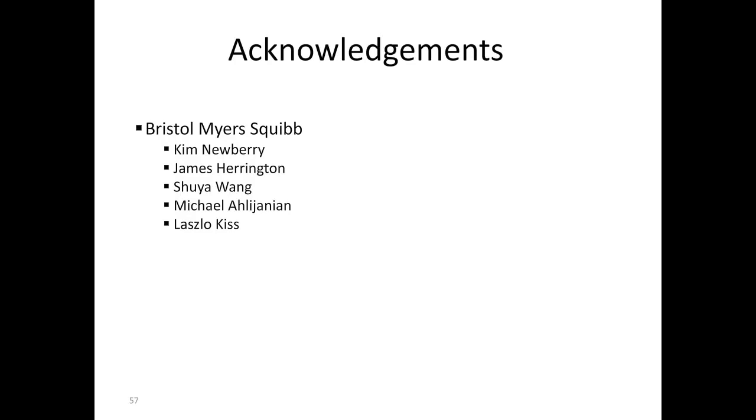As far as in vivo, we see similarities across all three of those platforms: what works on one tends to work in MEA as well as in vivo. It's just a matter of potency, and probably that's just a matter of whether it's getting to the target and other PK properties that are involved in vivo. But for the most part, there is nice alignment across recombinant cells, DRG on MEA, and in vivo.